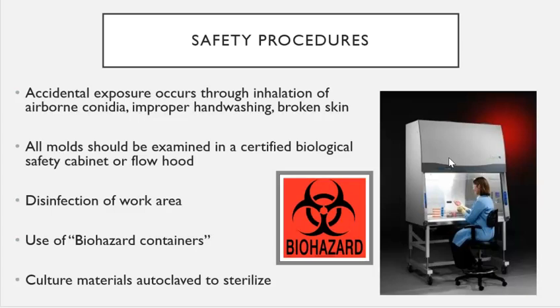You want to disinfect the work area where you've worked with any mycology samples. You want to use biohazardous containers to discard any materials or any specimens. And culture materials need to be autoclaved till sterile. And remember, our autoclave should be up to 121 degrees Celsius at 15 psi for 15 minutes in order to get specimens sterile and also instrumentation sterile.